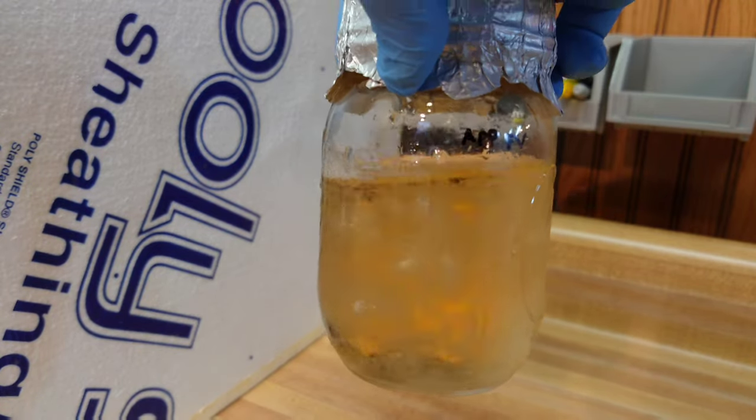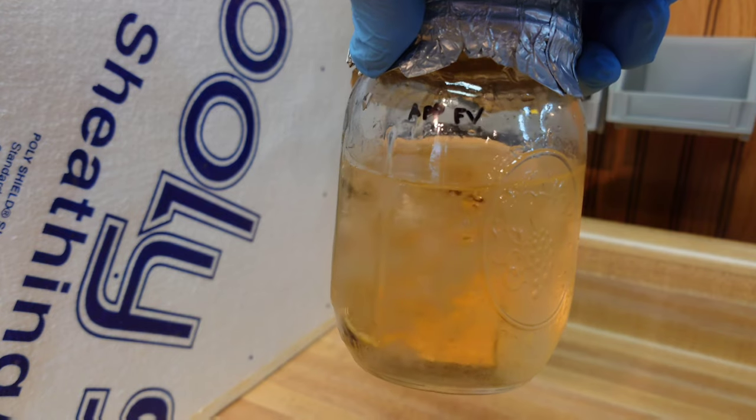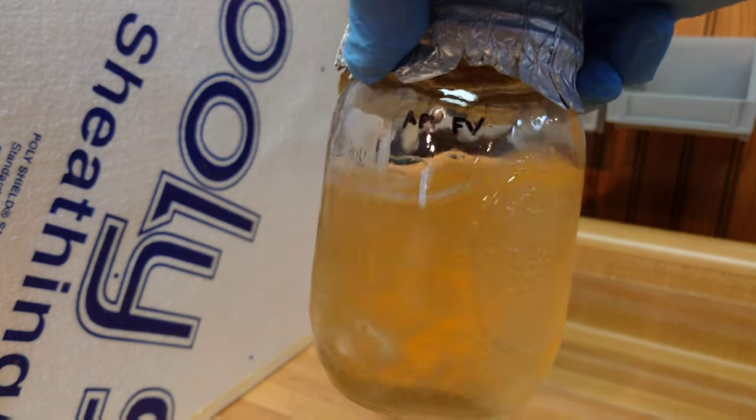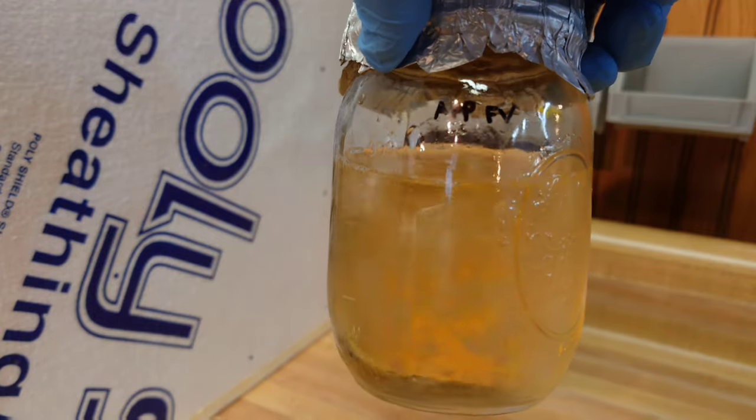Here's one more — this is Flammulina velutipes from Appalachian Gold, the best enoki culture on the planet. Got that one renewed as well. Again, that was just a direct injection.